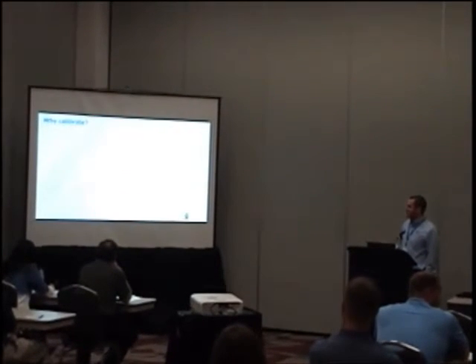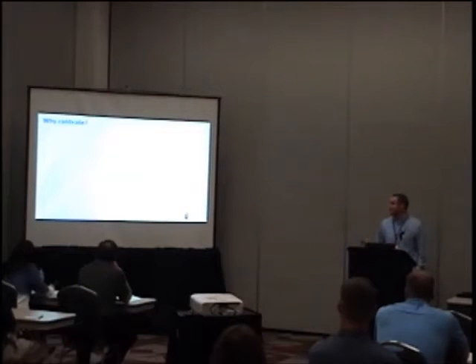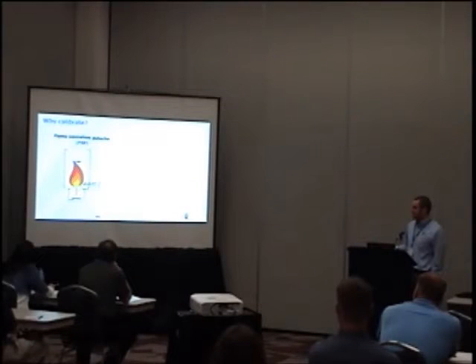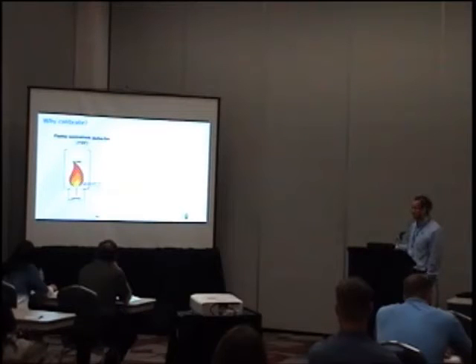Well, to understand why we calibrate and whether there's a way to eliminate calibrations of the FID, we need to go back and look at the flame ionization detector and understand why it has this different sensitivity to different compounds. So the flame ionization detector, as its descriptive name alludes to, is really just a flame with hydrogen and oxygen. And it burns compounds, carbon compounds, as they come through the flame, and it creates these carbon cations. And these cations are counted, or the electrons that are balancing them are counted with an ammeter in your GC.